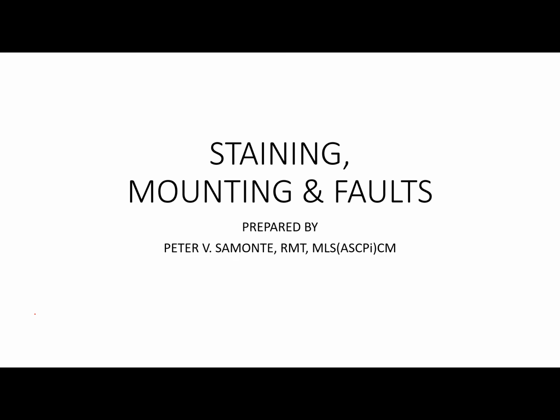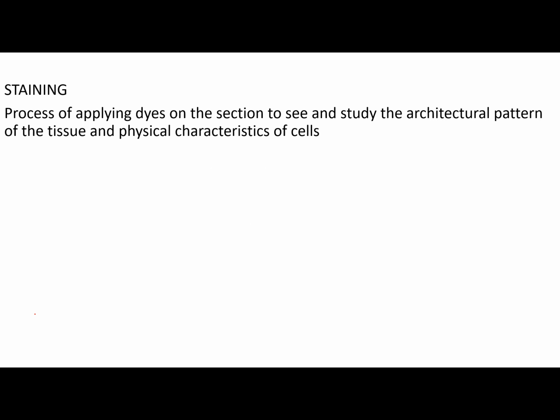Good day, class. So, for our meeting today, I'm going to tackle staining, mounting, and the different histopathologic faults that you would encounter when processing tissues. Now, let's start with staining, class.